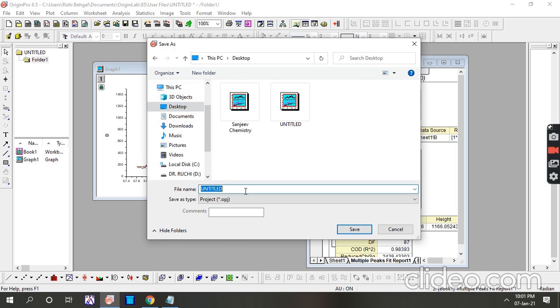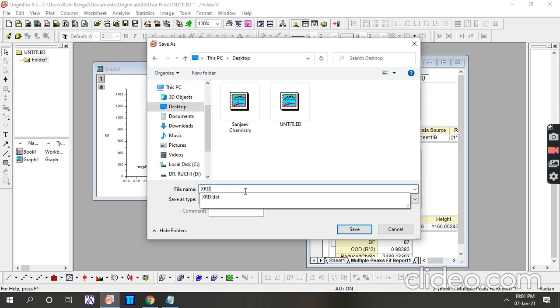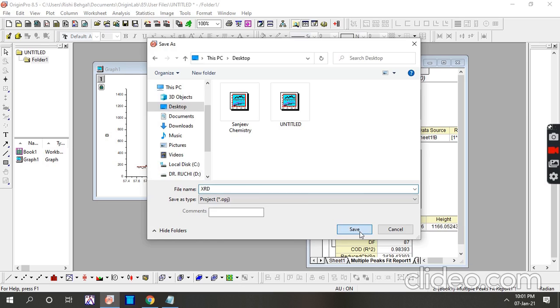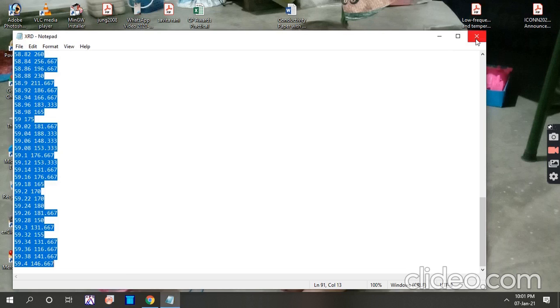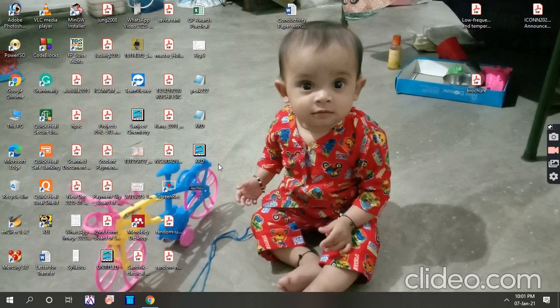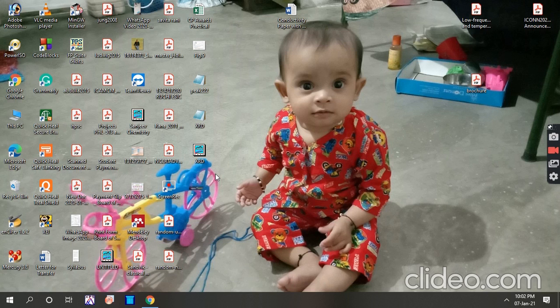Here you can see the XRD file. You can also use other software to calculate the full width half maxima of any peak — it may be XRD, it may be XPS, it may be FTIR. The software can be common, like Origin or XPECT software, which is another software to calculate full width half maxima, area under the curves, and Gaussian fitting.